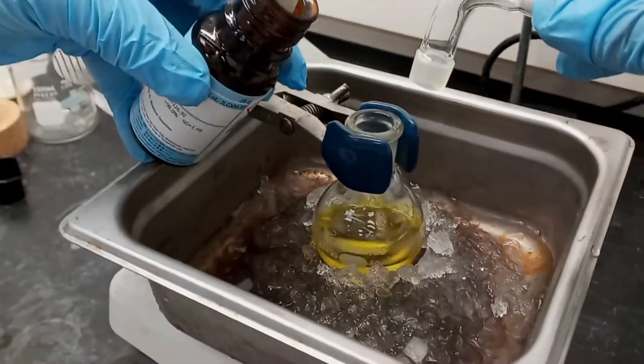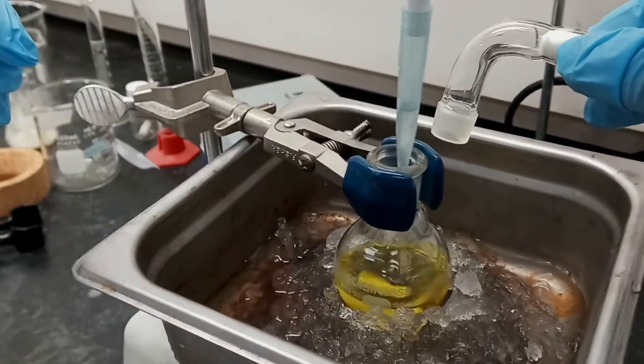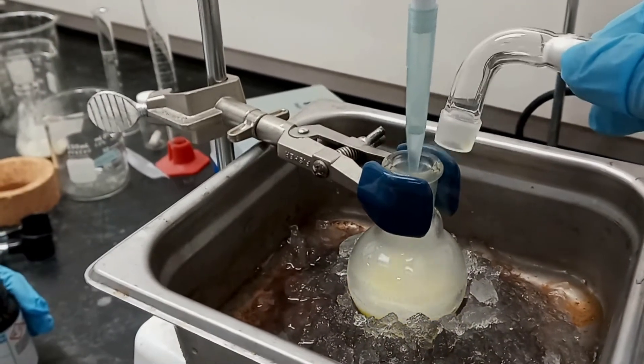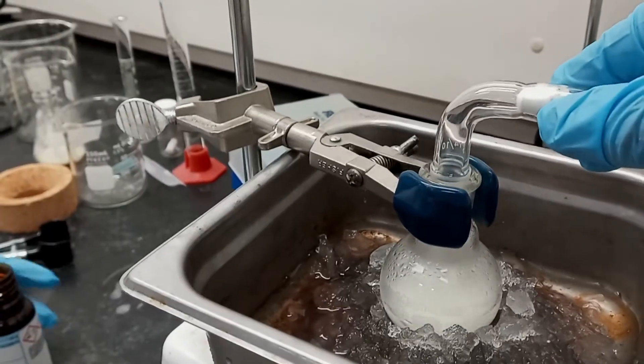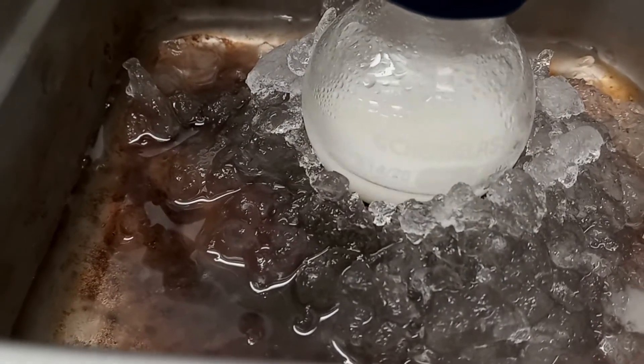Using a micropipette, we transferred into our solution 244 microliters of oxalyl chloride. We also added 358 microliters of triethylamine, but I forgot to capture it.